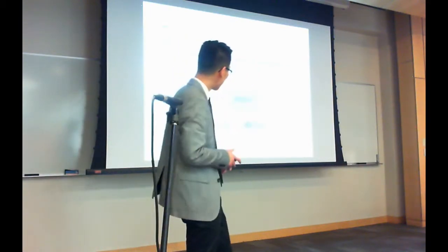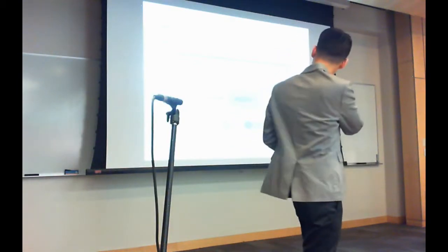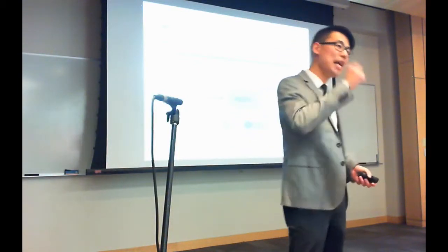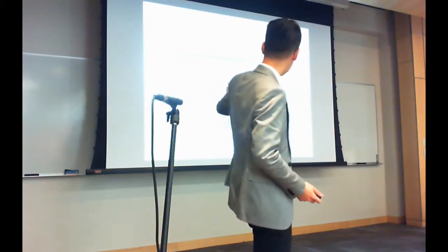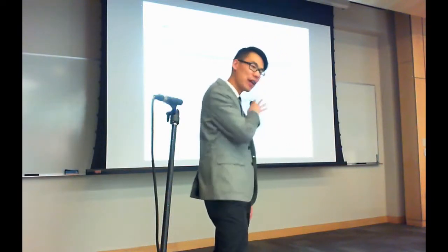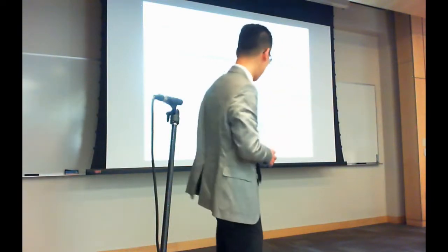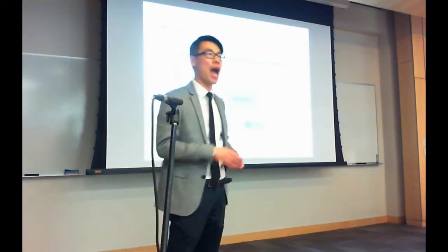And we actually took a bunch of this data. We took almost all of the human HCD data. So this is a particular fragmentation type. And that's about 31 terabytes that we reanalyzed. And this is about 85% of the total out there. And this is about 34,000 LCMS runs, a little over 500 million MSMS spectra.